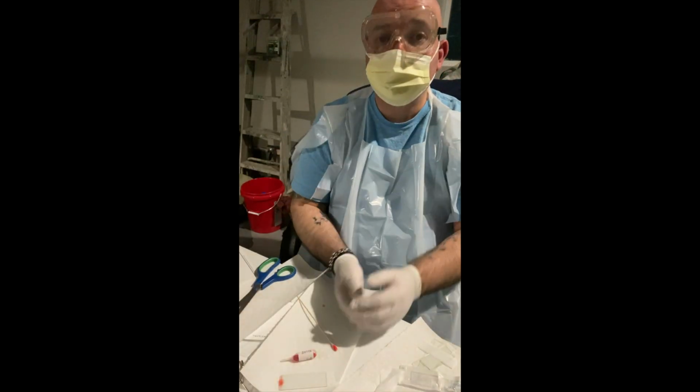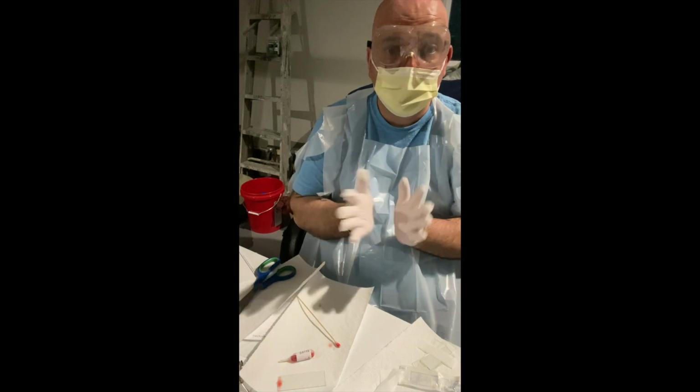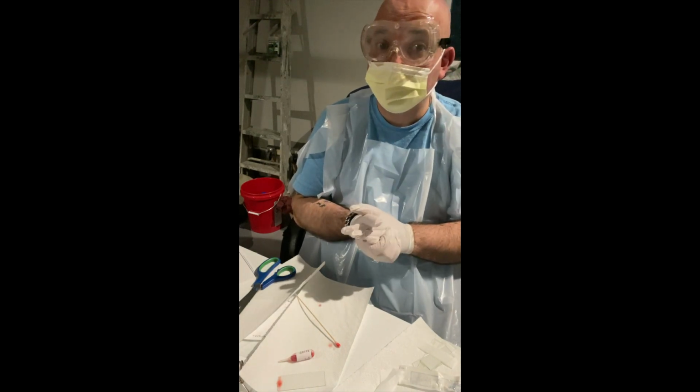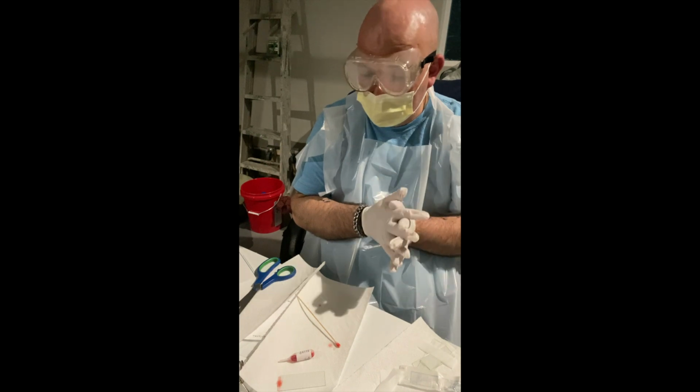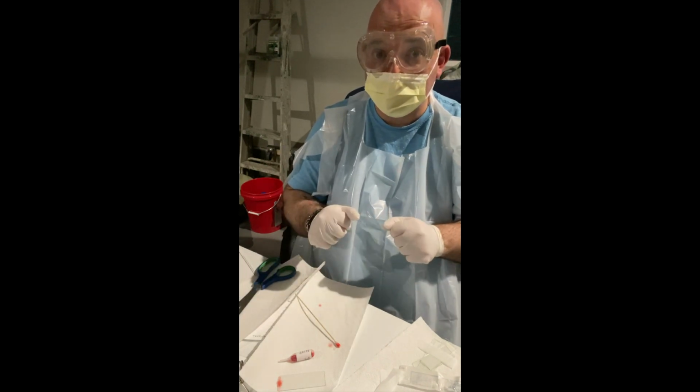Now after the slide dries, I'll take a picture of it and then view it under the microscope and upload it to my final report, which is kind of difficult to show. So at this point, we're done with the Congo red portion of the experiment.